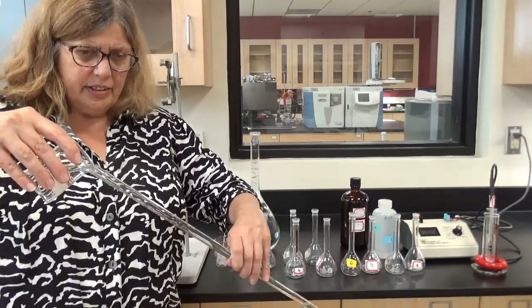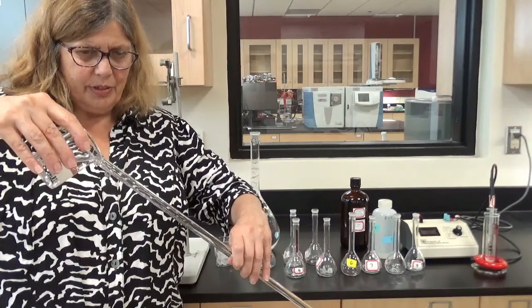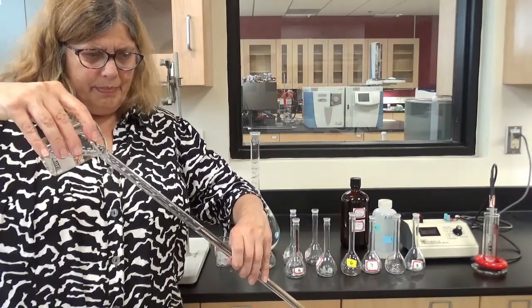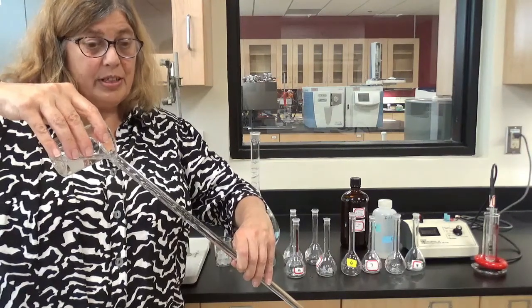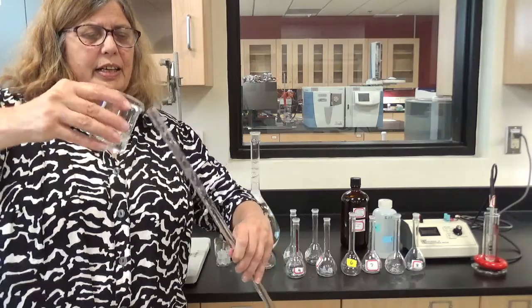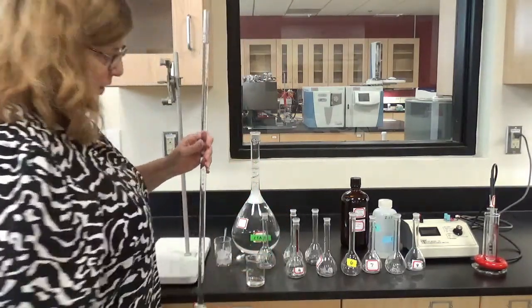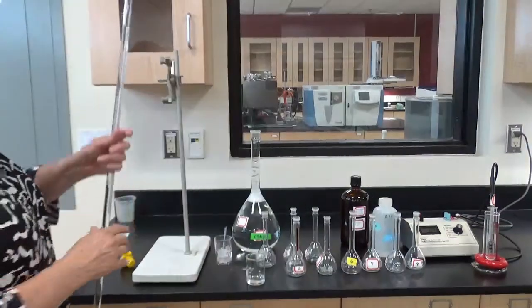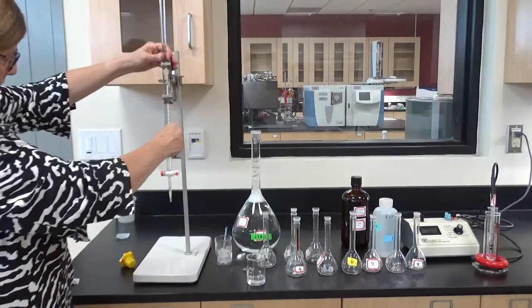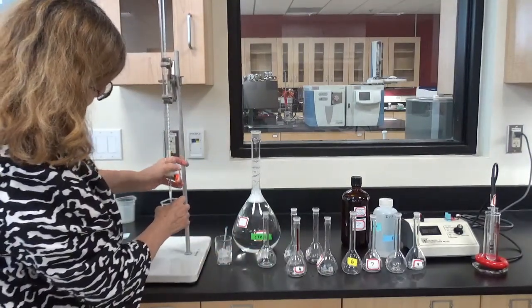This is basically a soap molecule, or similar detergent molecule, and I don't want a whole lot of bubbles in here, because then I won't be able to read my burette very well. So notice I really didn't get any bubbling when I poured it nicely down the side of the burette. Okay, so I'm going to put the burette over here. All right, and I'm just going to get rid of the bubbles in the tip.